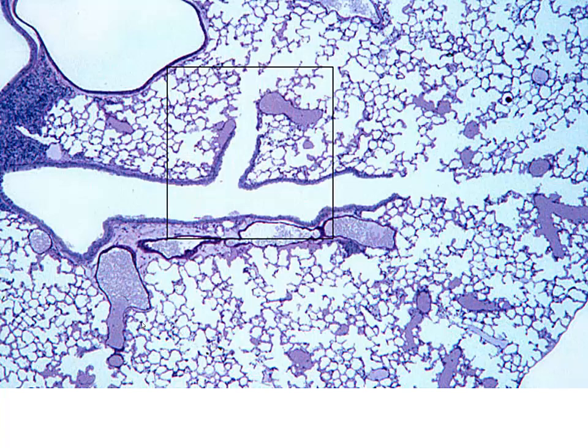Here we have a little bit of a lower mag view of our intrapulmonary tissue, and we can see a nice elongated duct. Again, we're not seeing cartilage at this point, so we're going to call this bronchiole. And you see how it tapers, the diameter tapers as you get toward the end. Here we have a branching, and again, you can see that the epithelium becomes interrupted at certain points until you finally lose it altogether. So we're going to say that this is terminal bronchiole to the point where we may have a relatively short or absent respiratory bronchiole moving into an alveolar duct.